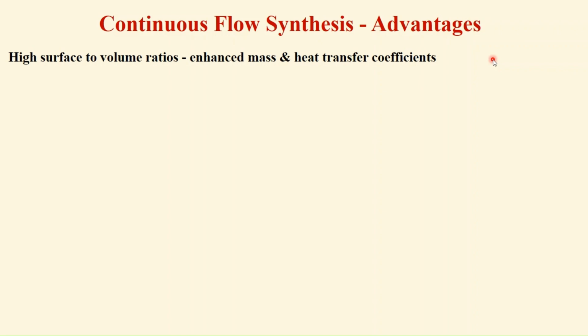Thus, quantitative yields can be achieved, which is a far distant possibility in batch reactors.